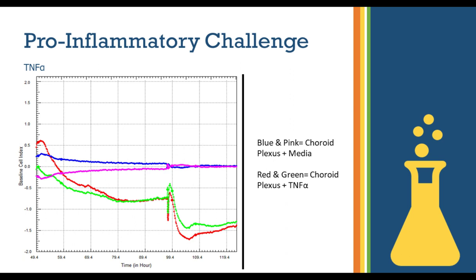And I know replicates are kind of an iffy subject, because do you mean replicates of animals, or do you mean replicates of studies? We repeated the TNF-alpha studies and dexamethasone studies with a couple other animals too. I believe there's 3 with TNF-alpha and 2 with dexamethasone. So in addition to multiple wells for each animal, we did have more than 1 animal to practice it in.